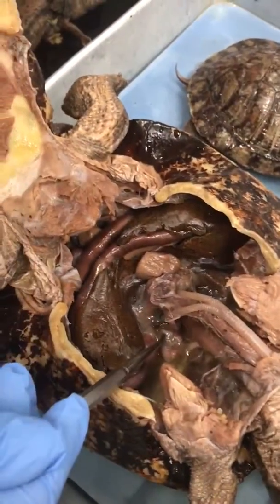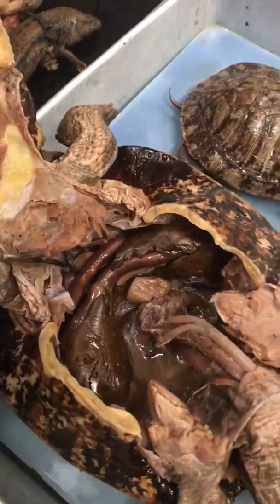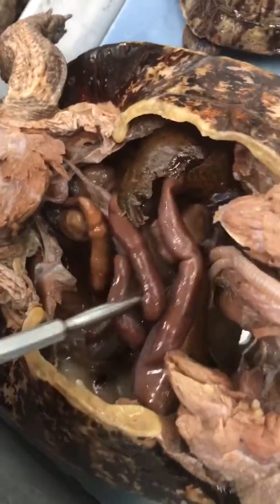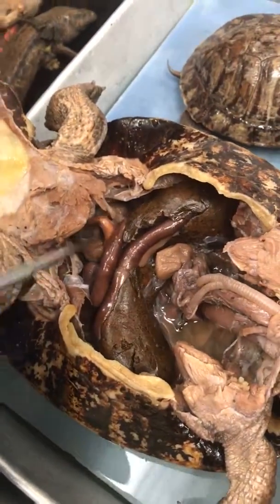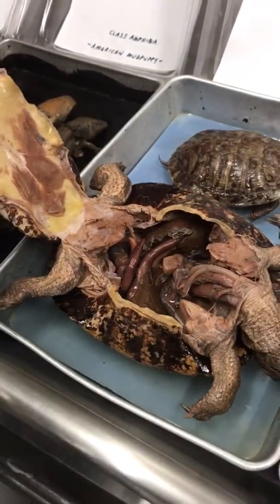Can you point to the intestines again? Yeah, it's kind of hard to pull out. All this part right here, that's going to be the small intestine. Cool. Is that it? Yeah, that's it.